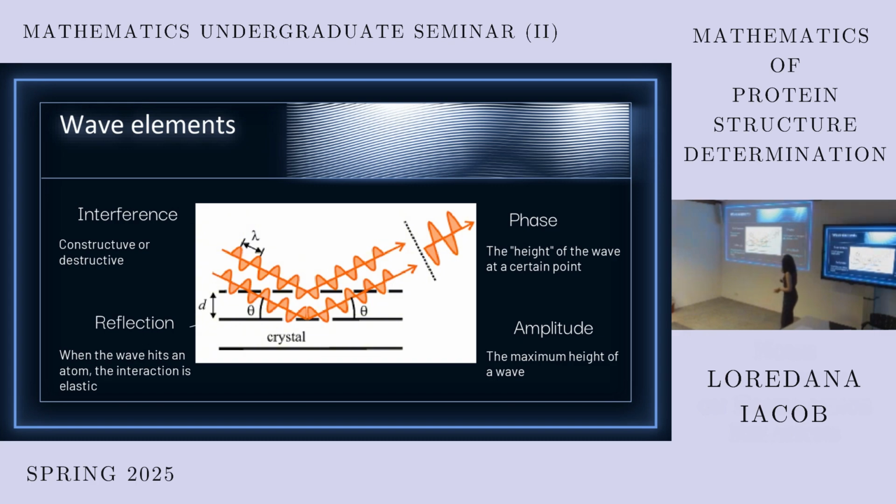The second plane. So how do we know that this distance here will allow the interference later? When they interfere, in order for an interference to take place, they need to be in the same phase. The height should be at the same place with the height and the lowest to the lowest. So if it goes a certain distance and the phase is equal like in the picture, for this it will look exactly opposite. It can look like this, and the maximum here will cancel the minimum here. Basically we plus something and then we subtract that and we don't get anything.